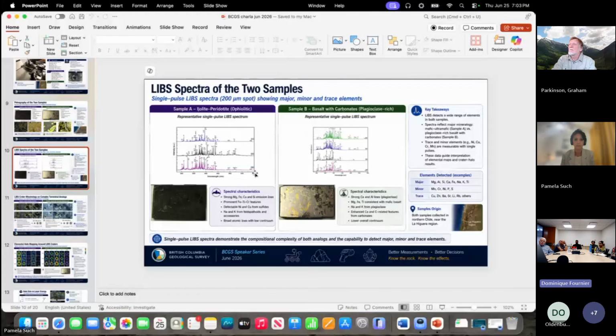Have you got any mining companies that are funding this or interested in using it, or what is the situation with mining? With LIBS today, yes, it's being used. They have created some hand LIBS. Can you tell us what mining companies? I don't remember them. I don't know. Maybe probably all of them. It's very common. It's very handy actually, LIBS hand tool in the field.